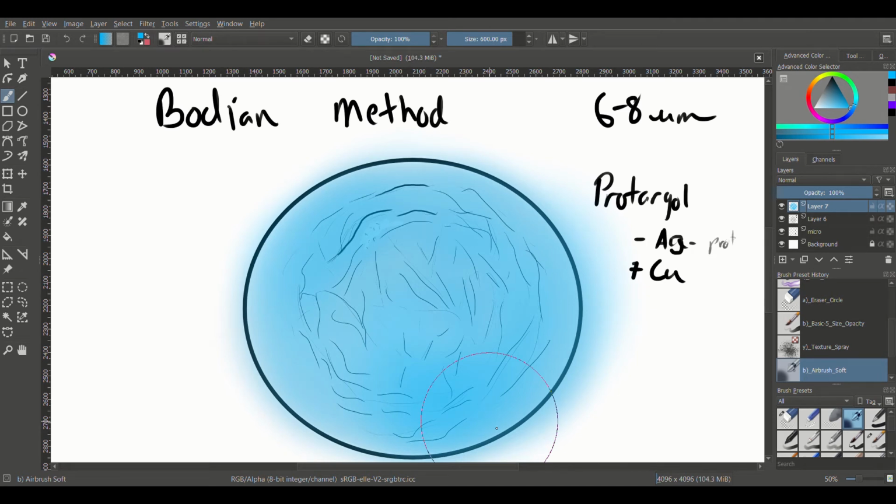So you're using silver impregnation with protargol, and we're using copper to get rid of anything on the connective tissue. Then we're using hydroquinone to reduce everything, gold chloride to tone, and then oxalic acid to develop it further, and finally that sodium thiosulfate to get rid of all the extraneous stuff, and then counterstain as needed. In this case, we used aniline blue. And that's your Bodian method.